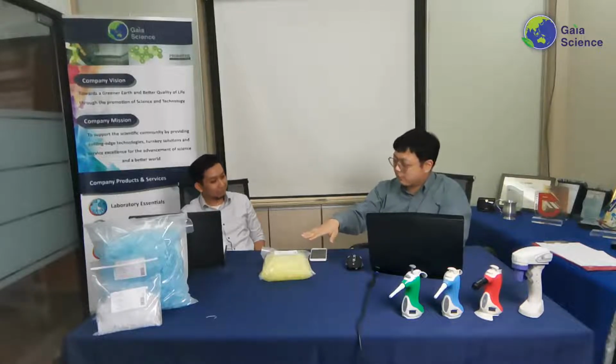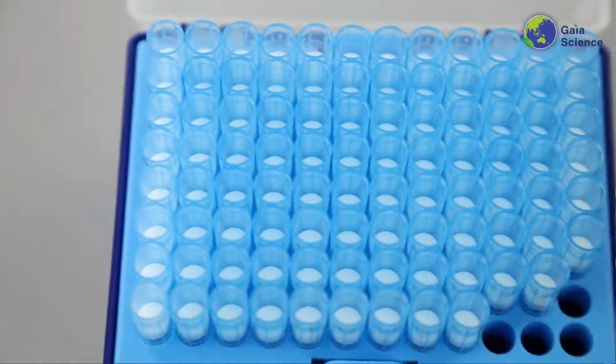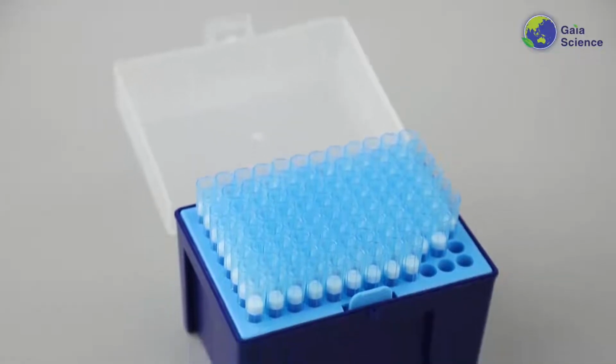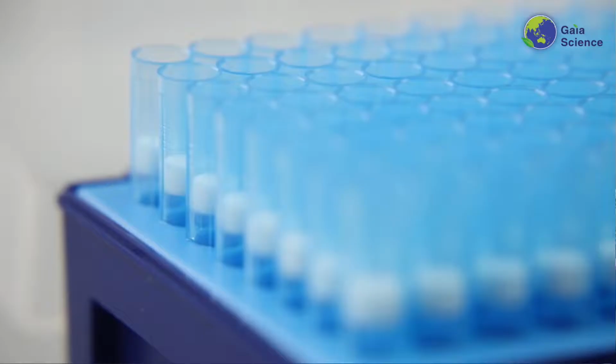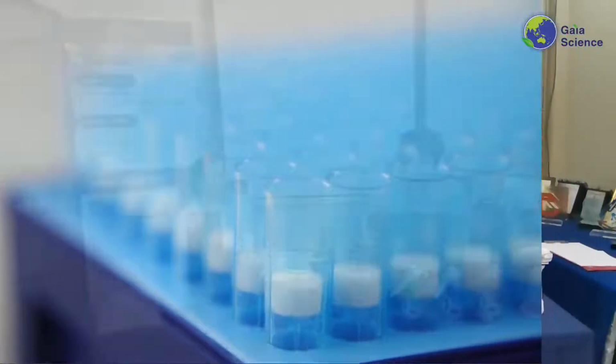Why not, right? Bulk tips are actually good because you get a really affordable price, and you can re-rack them as many times as you want. If you notice any empty racks in your labs, they normally have 96 holes. Each pack normally comes in 1,000, so you can re-rack them 10 times. At that expense, you're actually saving a lot by going with bulk, re-racking rather than getting new racks all the time.